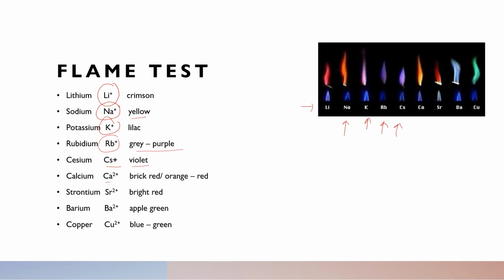calcium, Ca2+, brick red or orange to red; strontium, Sr2+, bright red; barium, Ba2+, apple green; copper, Cu2+, blue green.